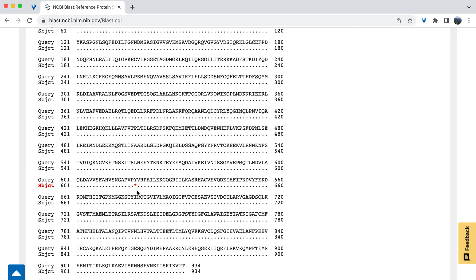If there was an insertion in the subject sequence, including extra amino acids, there would be dashes in the reference sequence as placeholders. If there was a deletion, there would be dashes in the subject sequence as placeholders for the missing amino acids.